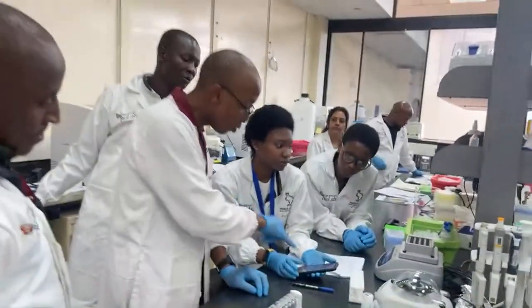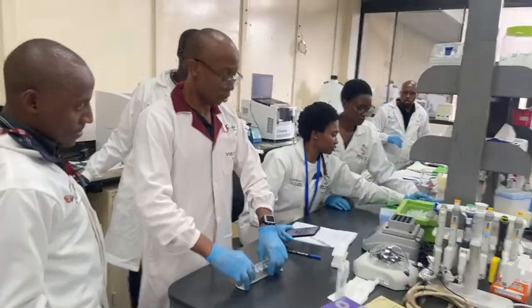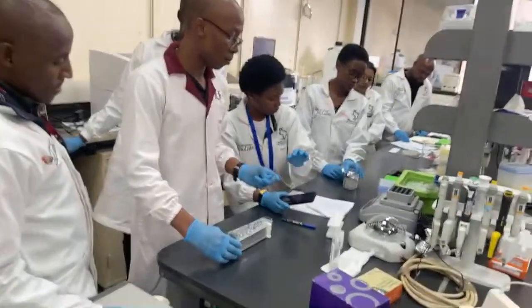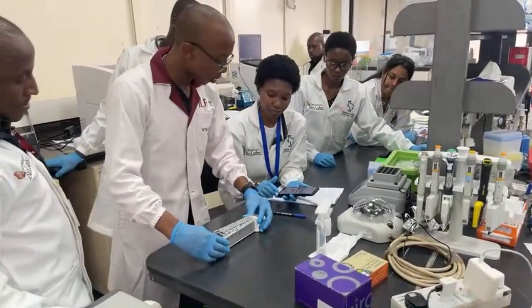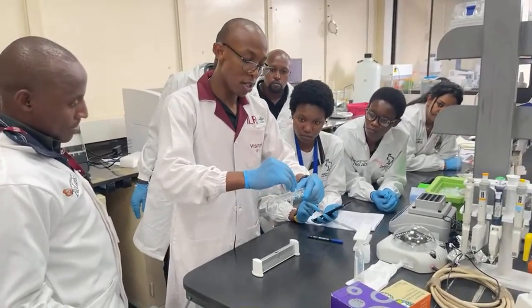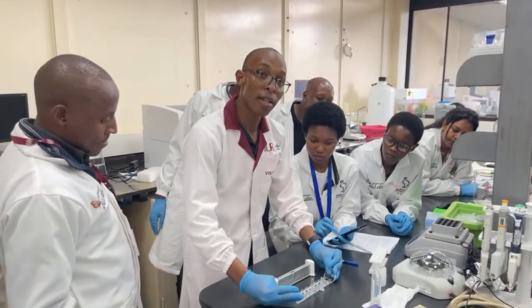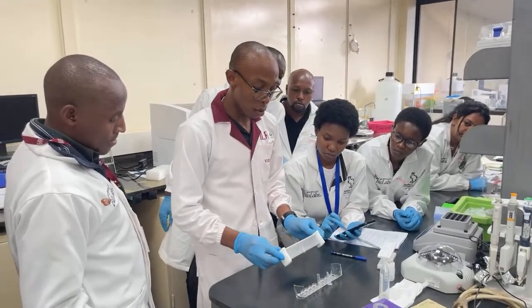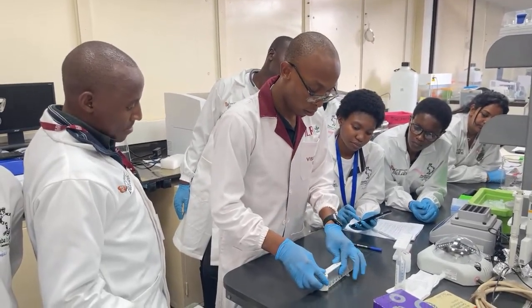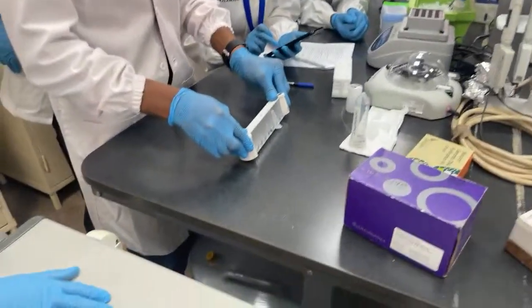We can use 1.5. Okay, let me do the demo then. This is your sample, right? The first bit, they tell us to remove this plastic, and then we just add our sample tube. Then we put it upside down, and then we put the magnet in, slowly, so it's holding the sample.